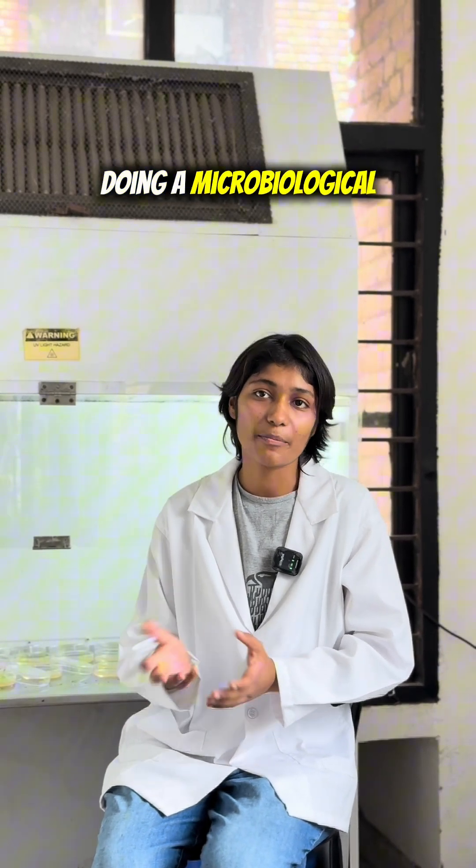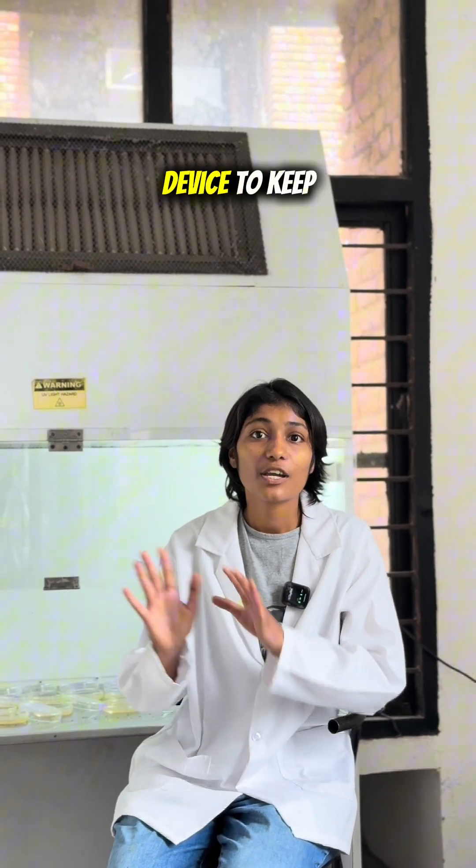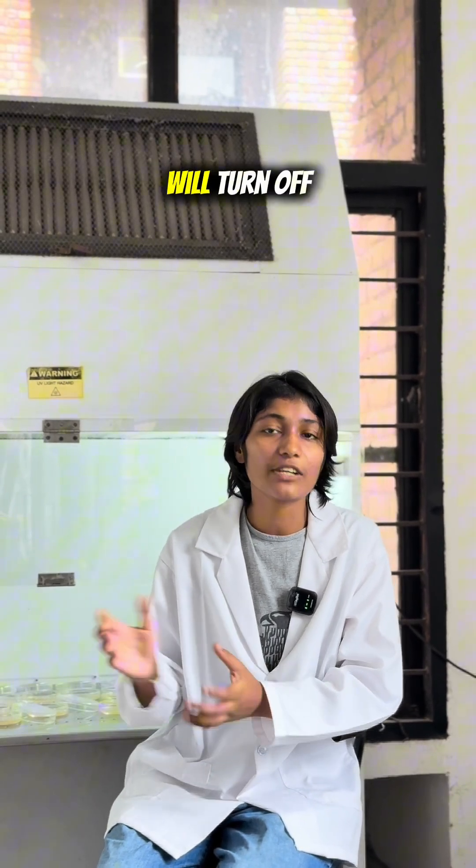Today we are doing microbiological testing — enumeration of bacteria — using curd as our food sample. We are working in a laminar airflow device, which keeps conditions sterile. Inside this device there is a UV ray, which we turn on prior to working. After 20 minutes of sterilization, we turn it off and proceed.